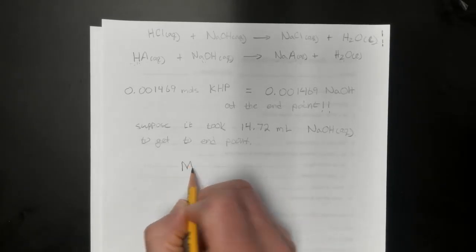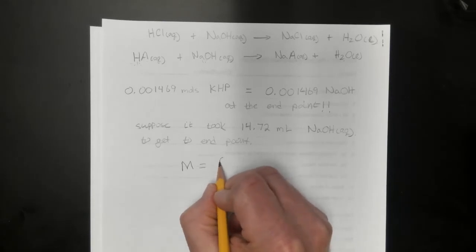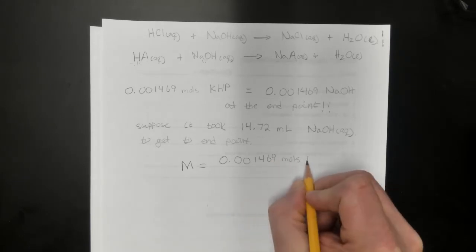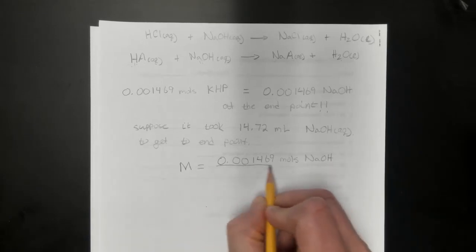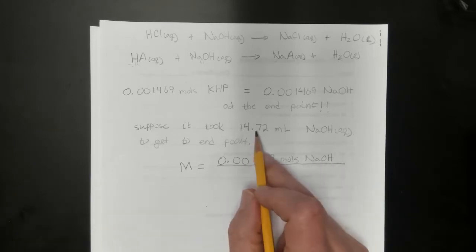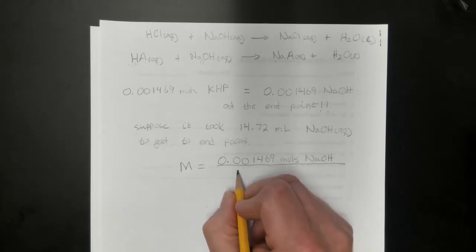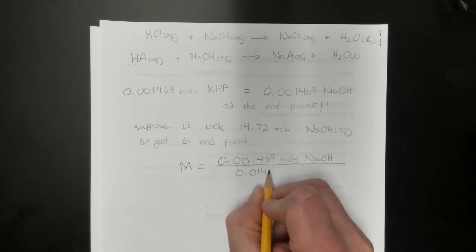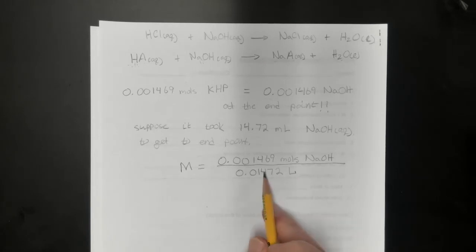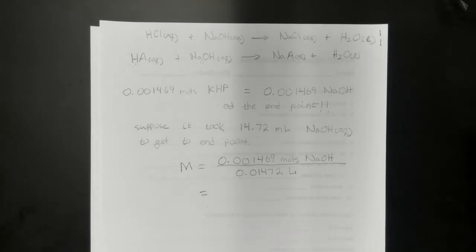The molarity of sodium hydroxide in this case will be the number of moles of sodium hydroxide present at the endpoint divided by the liters of solution that contained basically this number of moles of sodium hydroxide. There it is right there. Now it's in milliliters, so you have to make a conversion into liters because molarity is always in moles per liter. 14.72 milliliters is 0.01472 liters. And so you just do the calculation, and that gives you the concentration of your sodium hydroxide.